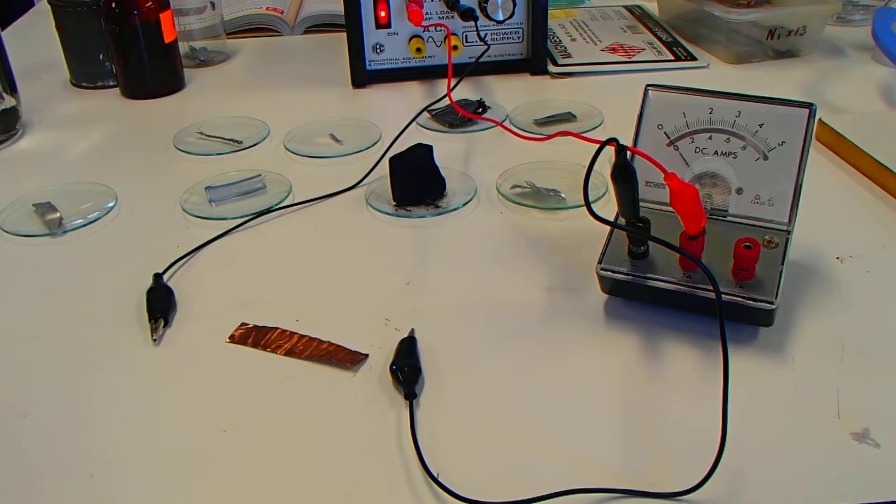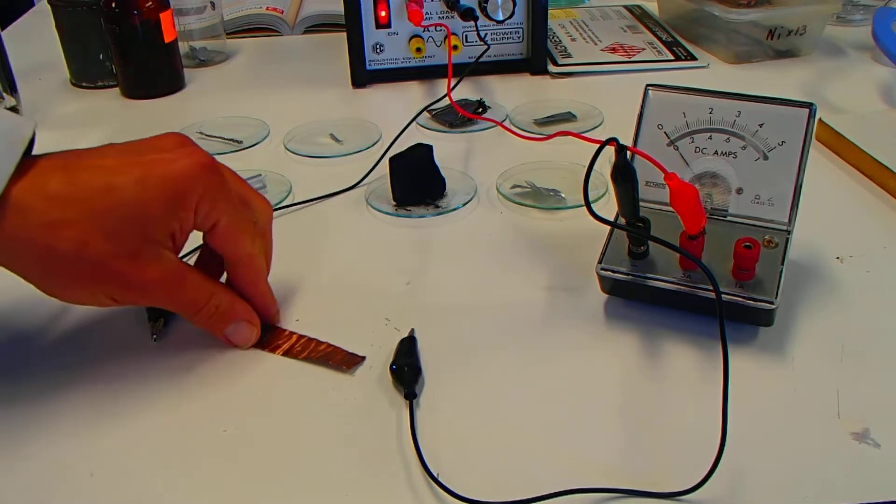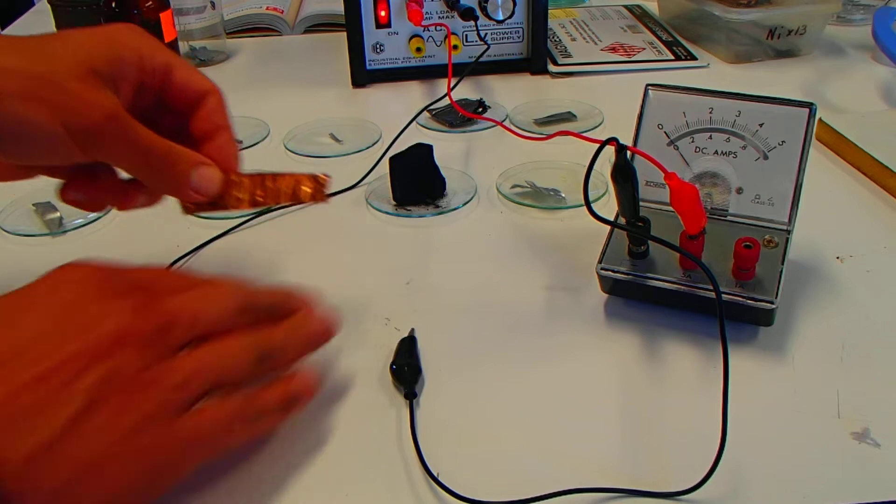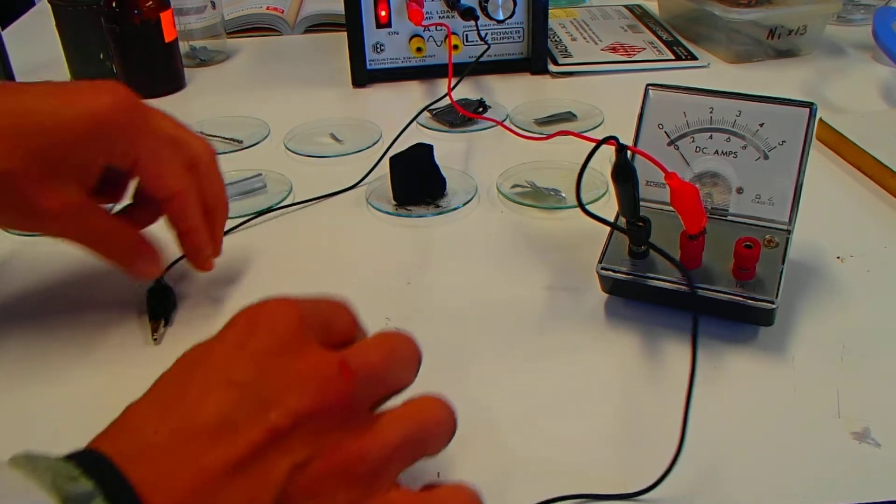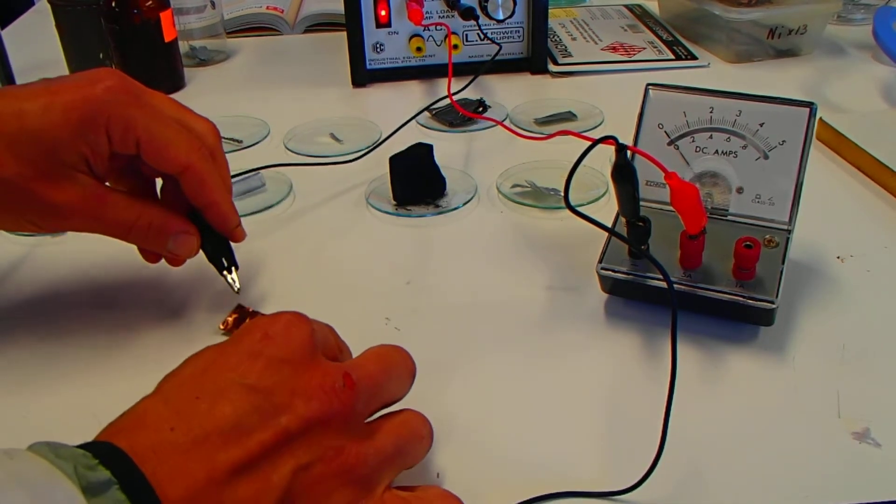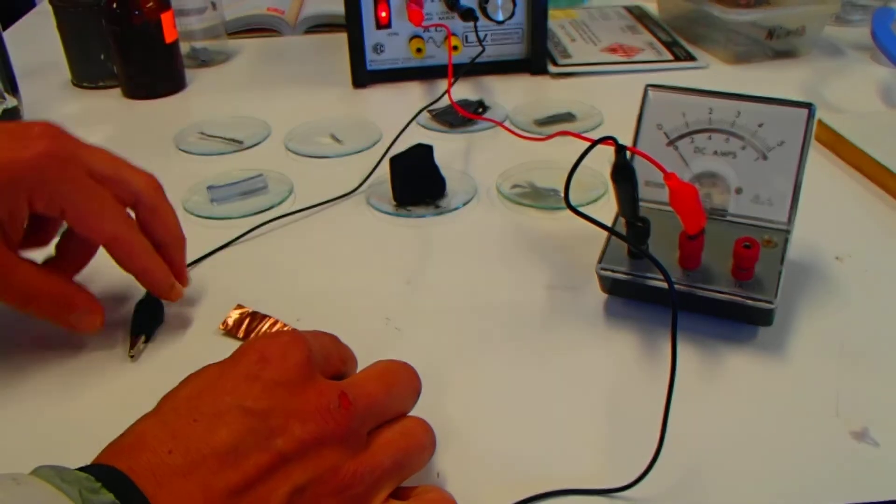It'll show us if there's any current being passed through the sample. I've just got a little bit of copper here to illustrate how it works. And you can see that when I place the two electrodes on copper, we should see a current being passed through.